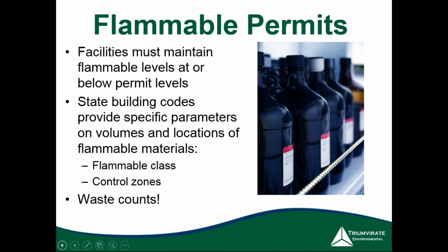Another cheaper option is flame cabinets. If you install a certain number of flame cabinets and you put material in there, it can help reduce the levels of flammables that are considered to be within a control zone.